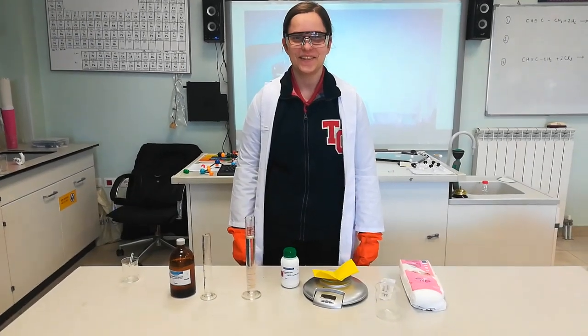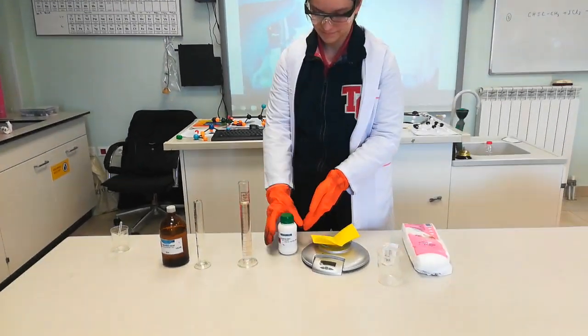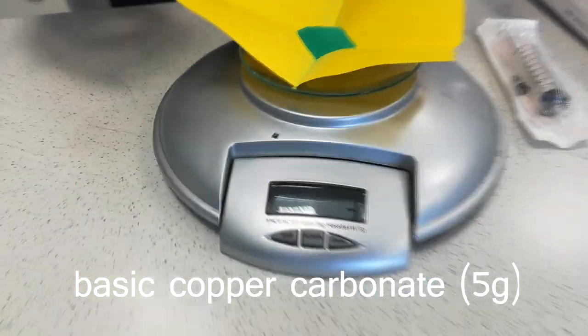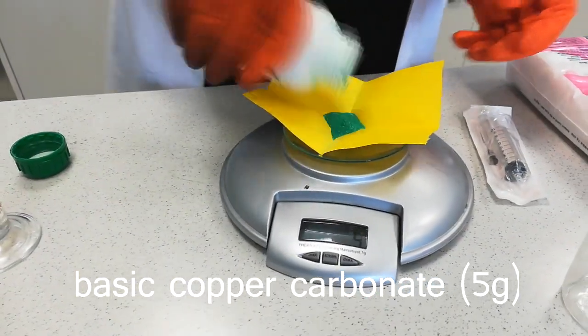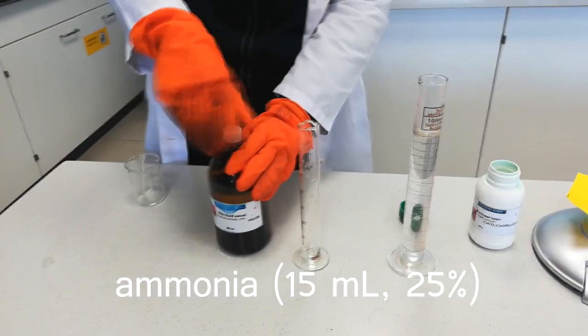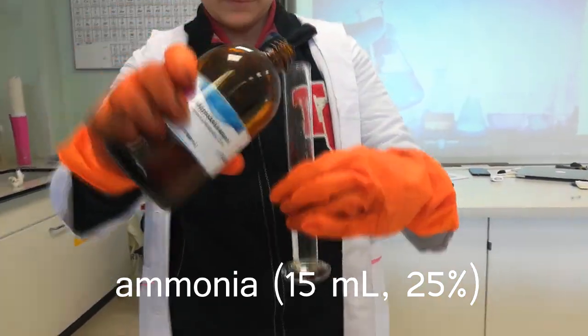The procedure is as follows. We start the experiment by preparing the solution of cellulose. To do this, we weigh 5 g of basic copper carbonate and add 15 ml of a 25% ammonia solution.